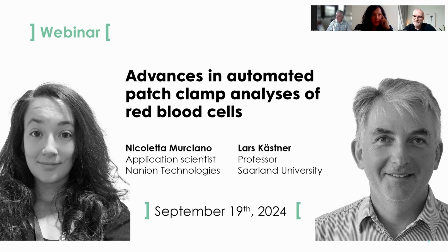It's more like Yoda1 elicited Piezo responding, and then the block of Gardos with TRAM34. And no, applying TRAM34, the current was smaller in erythroblasts, so more channels were apparently blocked than in red blood cells. But if you isolate the Gardos current, it's indeed bigger in erythroblasts.